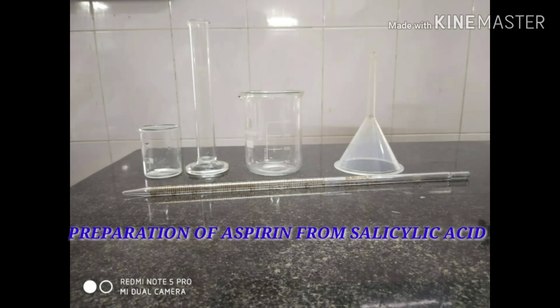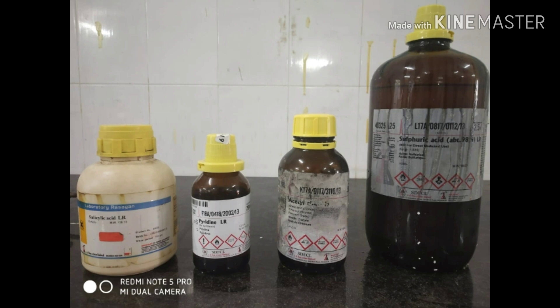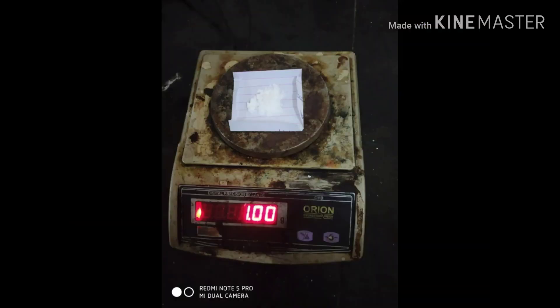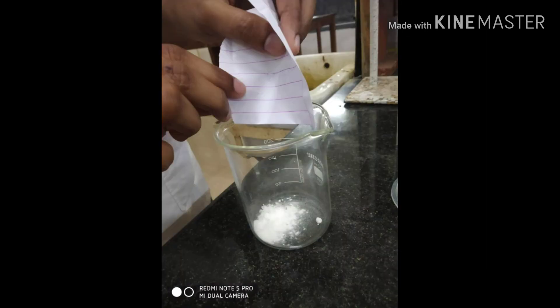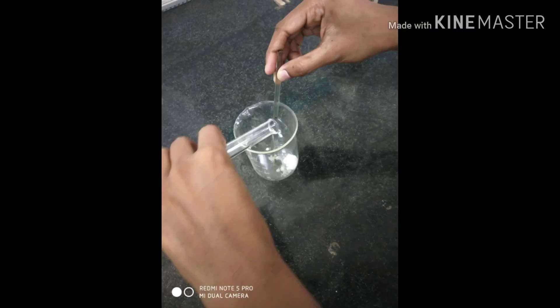Preparation of aspirin from salicylic acid. These are the apparatus and chemicals required. First, we have to weigh about 1 gram of salicylic acid and transfer it into a clean beaker, then add 1 ml of pyridine and mix well.